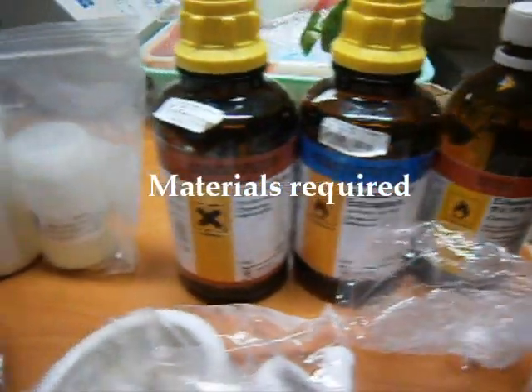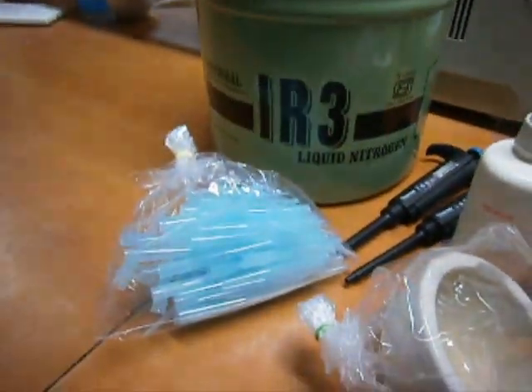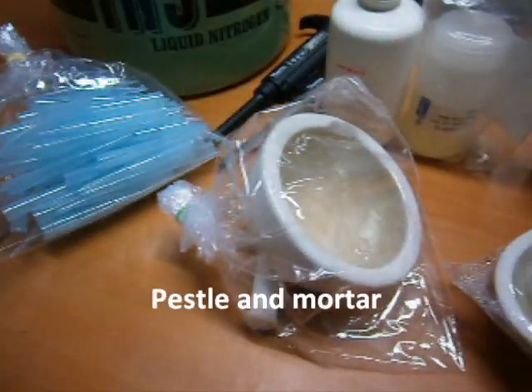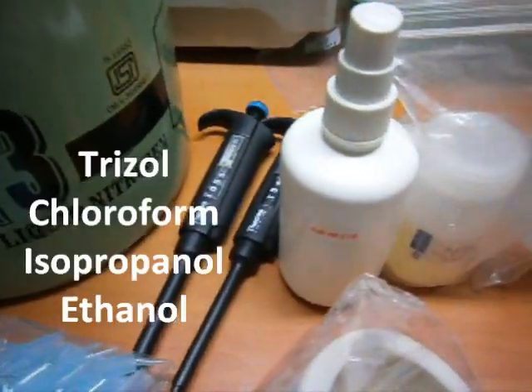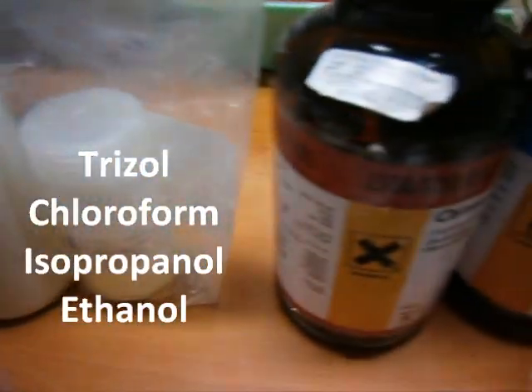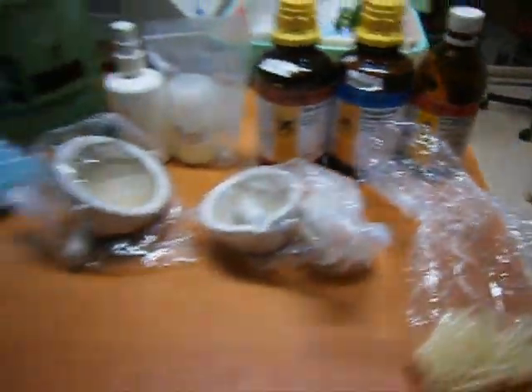RNA isolation from Raghi Co-12 variety. Materials required for the extraction are liquid nitrogen, sterilized pipette tips, pestle and mortar, pipette man, 70% ethanol, triazole solution, chloroform, isopropanol, ethanol, and gloves.